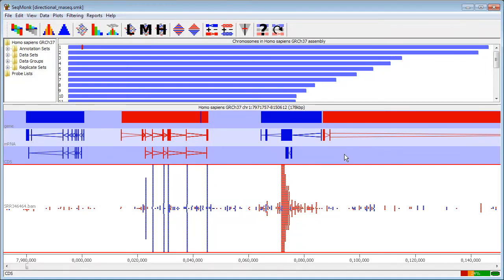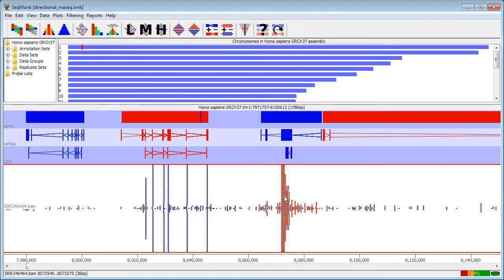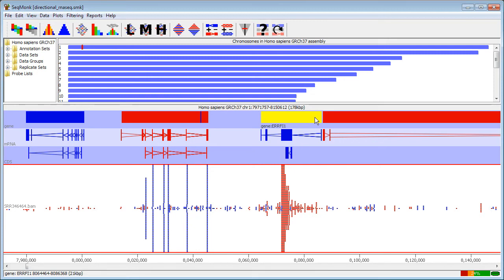In this video I'm going to go through the process of identifying antisense transcription from a directional RNA-seq library. You can see that I've imported my directional RNA-seq data already, and in this case the majority of reads have a direction which is opposing the direction of the feature that they sit underneath. So this is an opposing strand library. Different techniques will produce libraries that are on the same strand as the feature. You just need to take note of which is which.